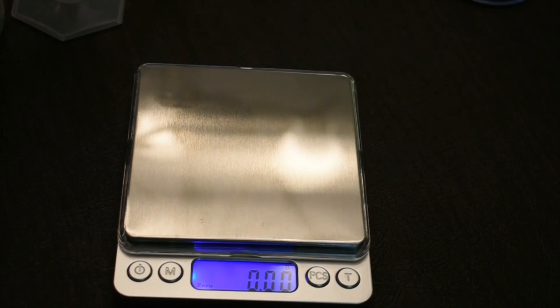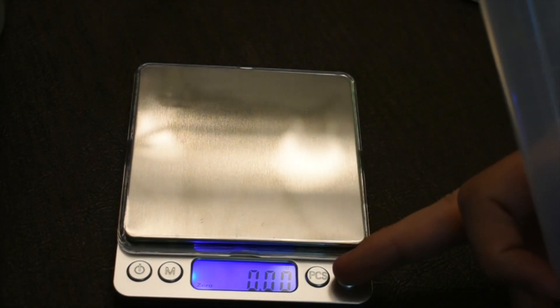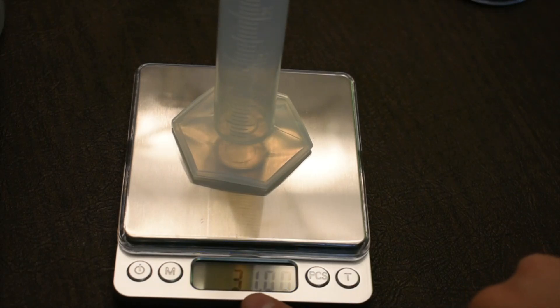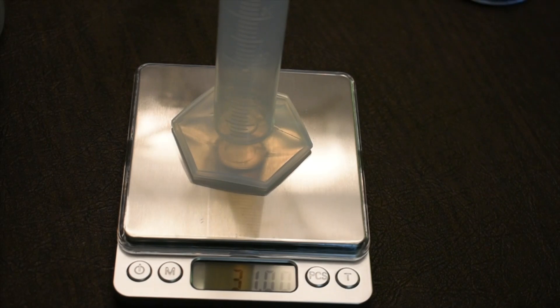To measure the mass of an object, turn the balance on, hit tare, make sure it reads grams, then place the object on it and let it measure. For example, the graduated cylinder reads 31.00 grams. Record all significant figures — it could have been 31.05, so you write down 31.00, 0.50, or 0.52, whatever the balance shows.